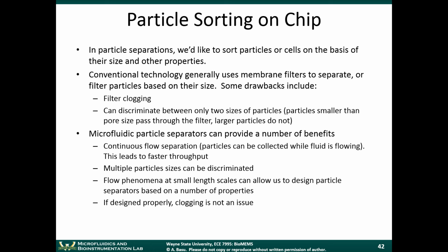You can also discriminate between multiple particle sizes, and you can design particle separators based not just on size, but other properties as well, for example deformability, charge, or dielectric properties. And if it's designed properly, clogging is not an issue.